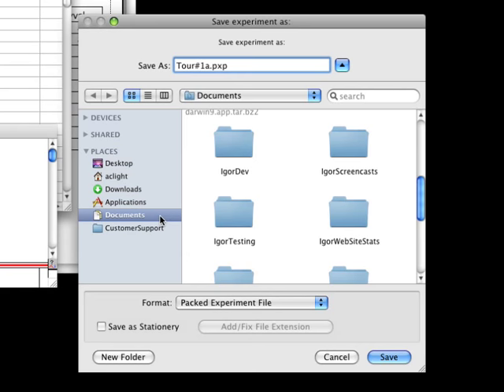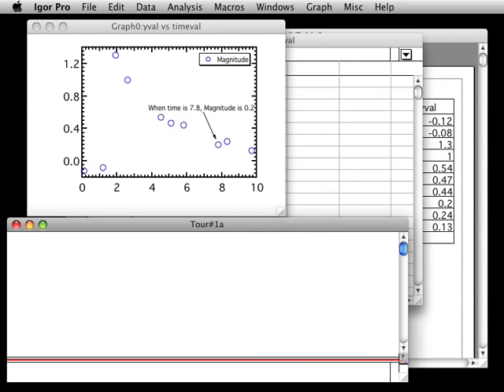Once everything is set correctly, click the Save button to save the experiment. When you next open this experiment, Igor will recreate all of the graphs, tables, waves, and other objects, just as they were when you saved the experiment.